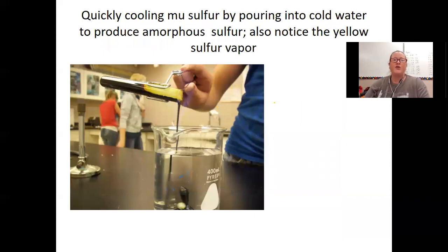Okay, and then we quickly cooled this. Actually, you can see that this one ignited here. There's some flames. We quickly cooled it into amorphous sulfur. And what happened is these sticks were frozen in place. So with amorphous sulfur, these sticks are frozen into place. Amorphous sulfur. There may be an occasional ring here and there.